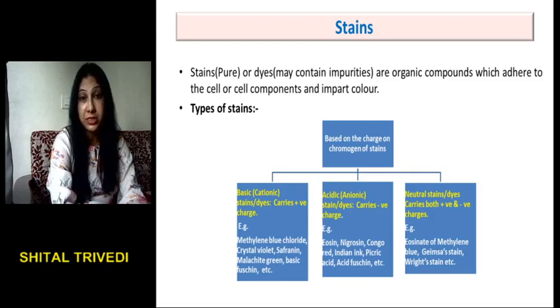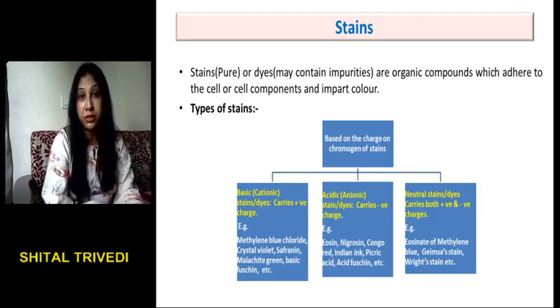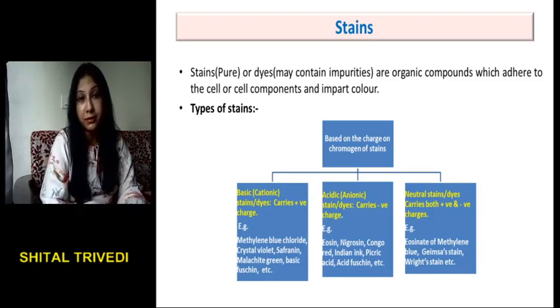The staining reagents contain a basic benzene ring structure along with a functional group responsible for the coloring, called the chromophore, attached with the auxochrome, the salt form, which gives the ionic property to the chromophore. The auxochrome helps to bind the stain with the microbial cell surface or cellular components, and the chromophore imparts the color upon binding with the microorganisms.